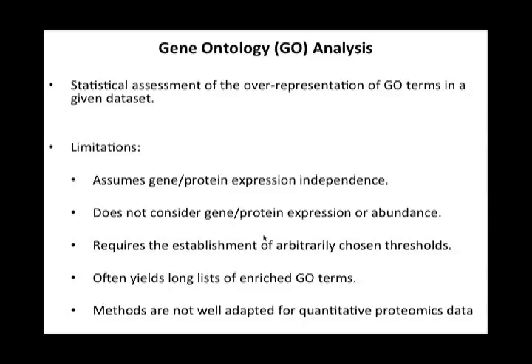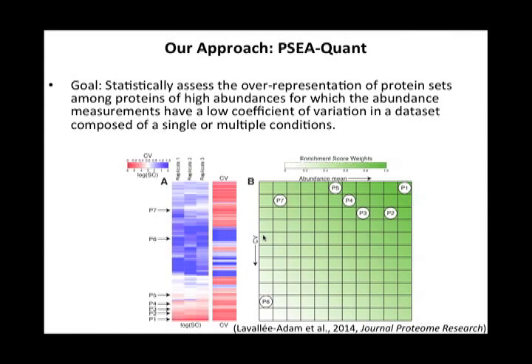And also the methods are not that well adapted for quantitative proteomics data and some of its features, such as the reproducibility of the data. So for all these reasons, in the Yates lab, we were interested in trying to provide a tool that would be more interesting for quantitative proteomics analysis, and we therefore developed PSEA-Quant.